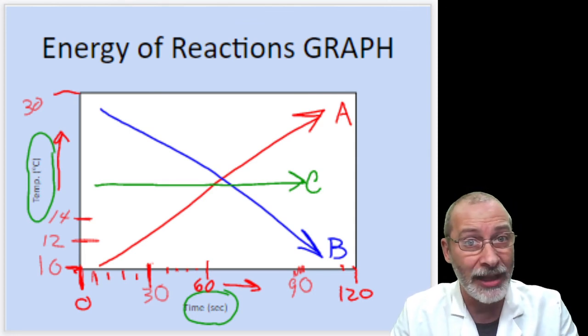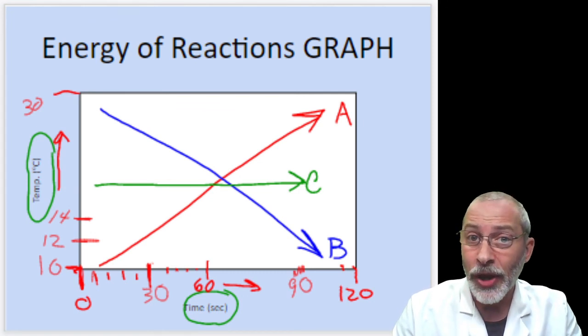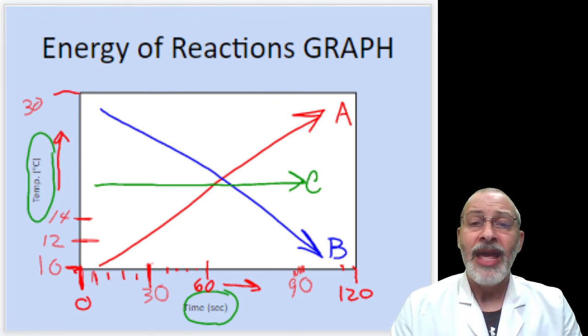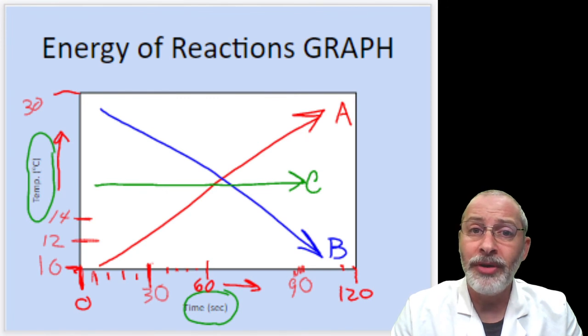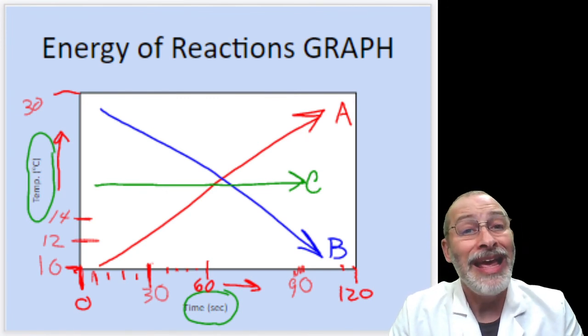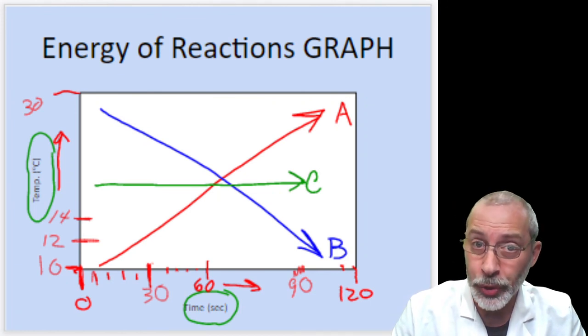Now, your challenge is this. I'd like you to watch the lab video, record your data, and then draw your graph, determine whether it is an exothermic or endothermic reaction, answer the questions, and write your conclusion.